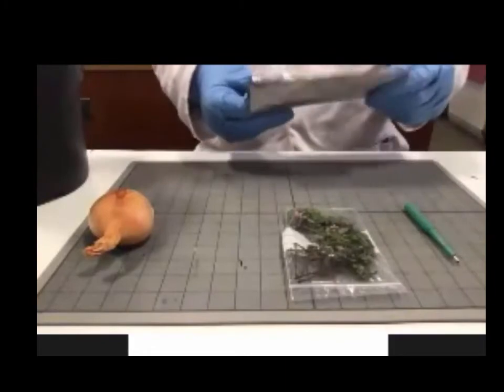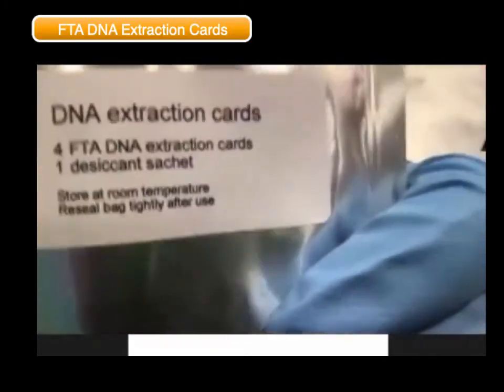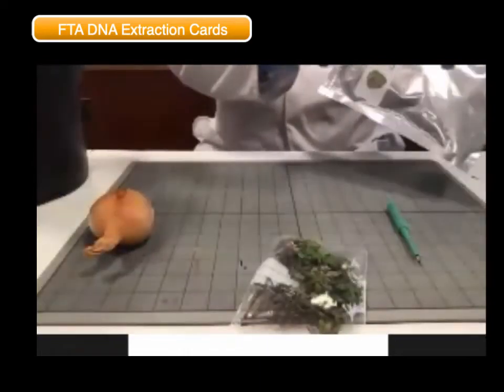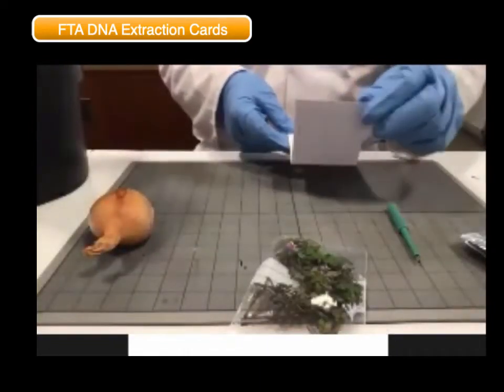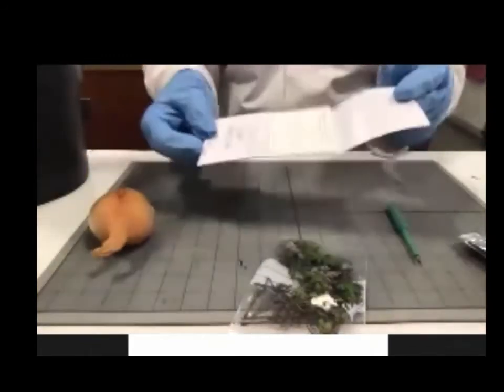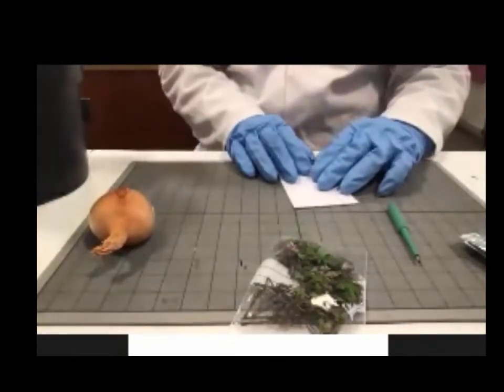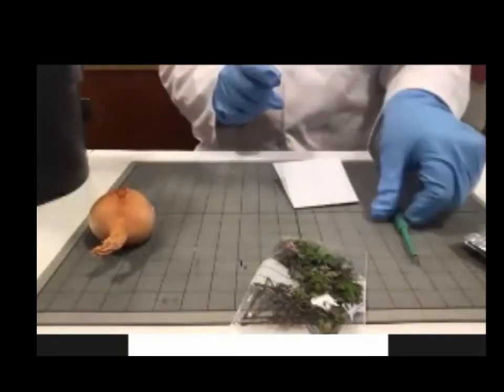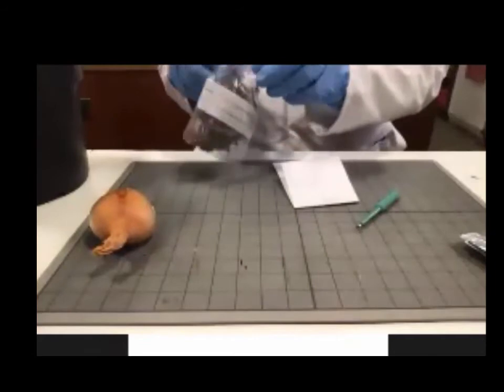You can see these are called DNA extraction cards, in the packet. It's a peculiar thing, a whole new thing for me. The chemicals for the extraction of DNA are impregnated into the card. And what I've got is a native Irish geranium that I collected yesterday.